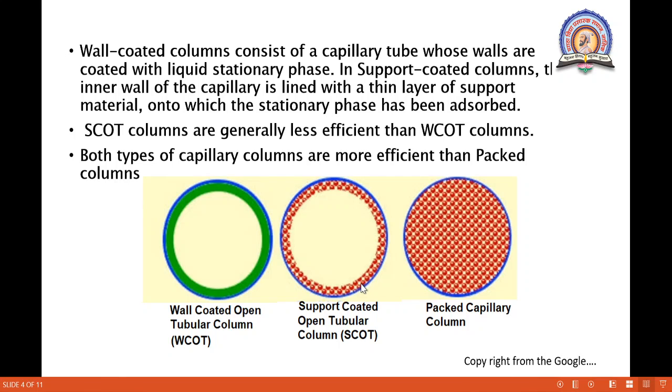Okay. These SCOT columns are generally less efficient than the wall coated open tubular column.